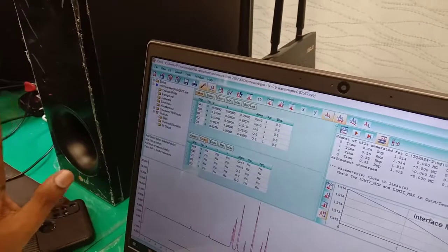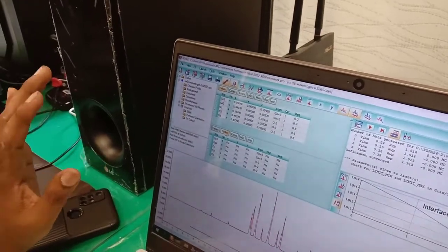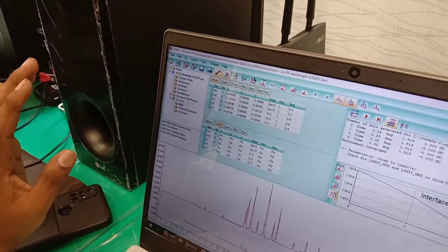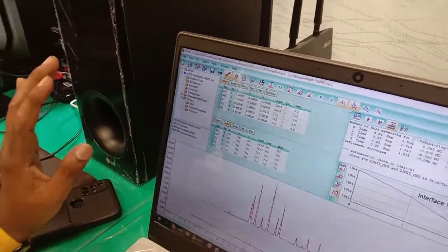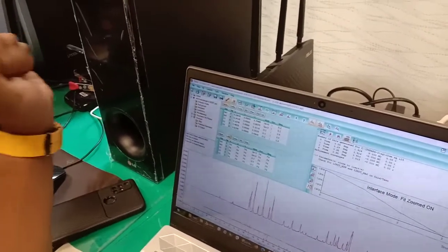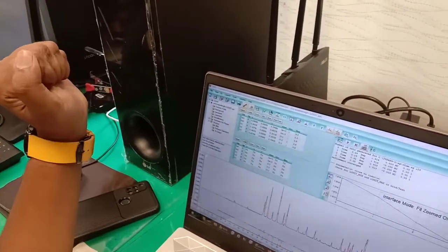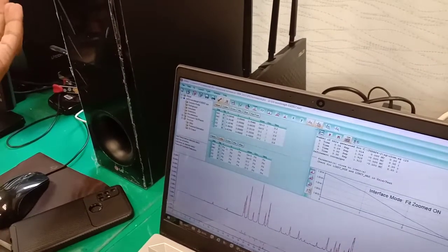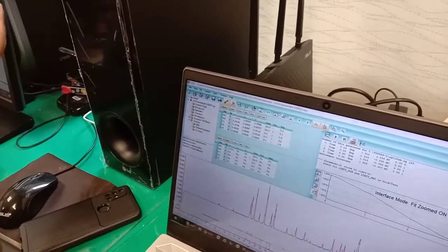You come for the codes, you choose the atoms. So when you do the refinement, normally people will advise you to choose from the heavier atom to the lighter atom, which means you have to fix the position of the heavier atom, then move the lighter atom around it. So in this case the heavier atom will be gallium 1. So I just choose gallium 1.